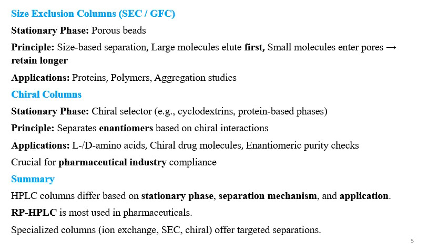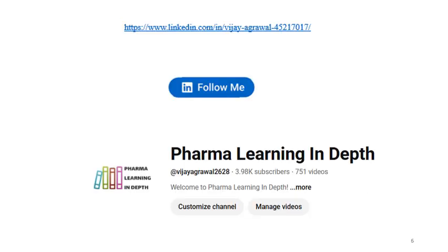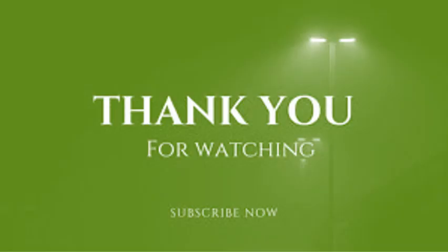HPLC columns differ based on the stationary phase, separation mechanism, and the application. Reverse phase HPLC is a widely used technique in the pharmaceutical industry. Specialized columns are available for targeted separations, like ion exchange, size exclusion, and chiral columns. This is the information for columns used in HPLC.